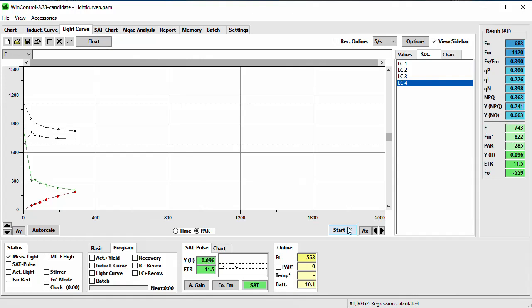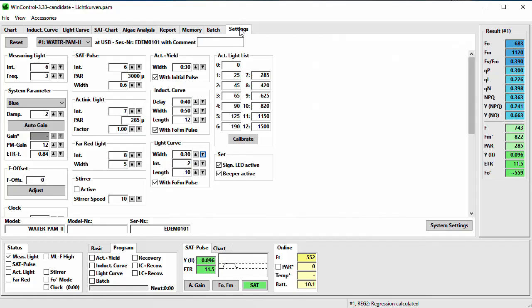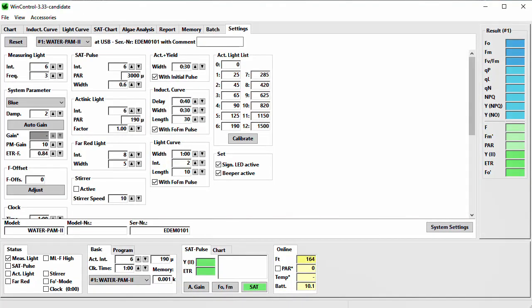The settings of the light curve and induction curve protocol can be adjusted on the Settings tab, which has fields showing the protocol parameters. For both protocols you have the choice to measure an FO/FM at the beginning or not — if you already dark-adapted your sample and measured the FO/FM, please uncheck these checkboxes, and the last determined FO/FM will be used for quenching parameter calculations. The induction curve protocol parameters are: Delay — the time interval between protocol start and onset of the actinic light; Width — the time interval between SAT pulses during actinic illumination; and Length — the number of SAT pulses during illumination, therefore the length of the induction curve.